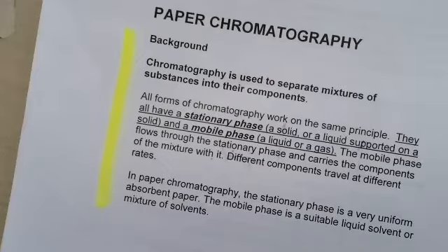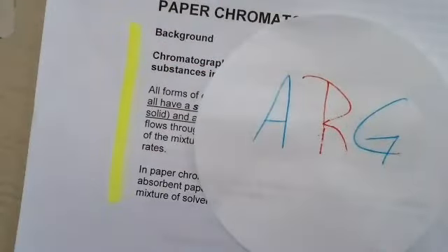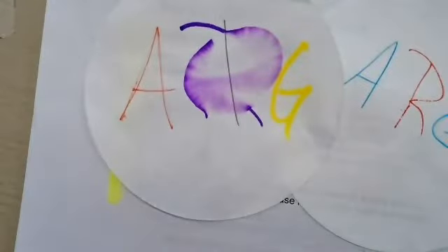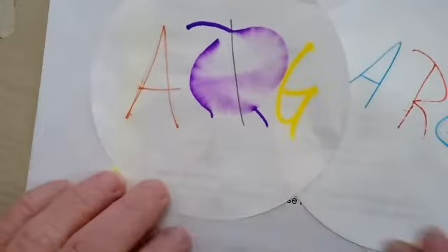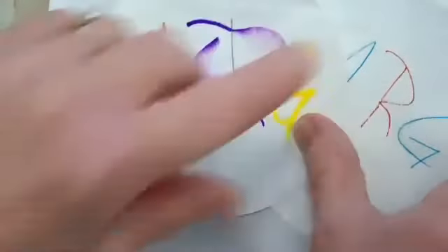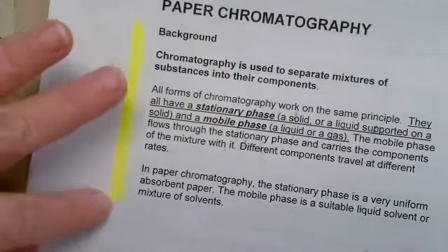Yesterday, we each had our piece of filter paper that we deposited and made our initials or a smiley face with the same color pen, different color pen or markers. And then we exposed this to drops of ethanol solution. We experienced different things. So in this exercise, how is that reflected here?